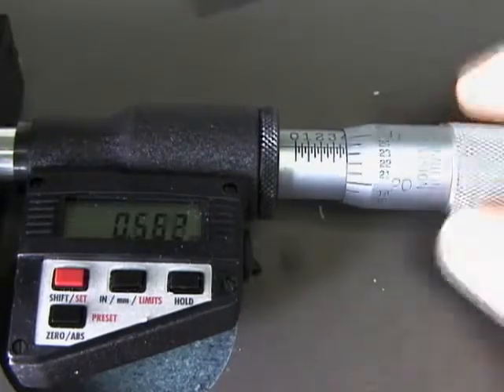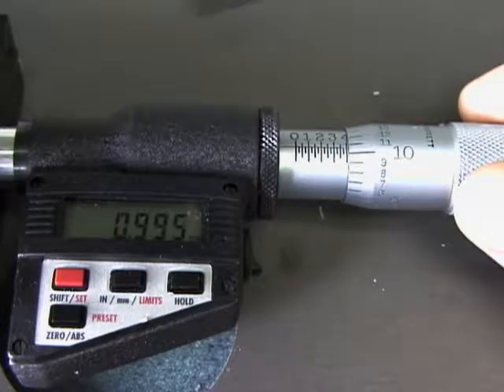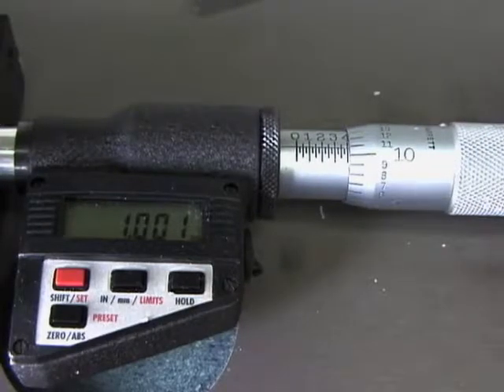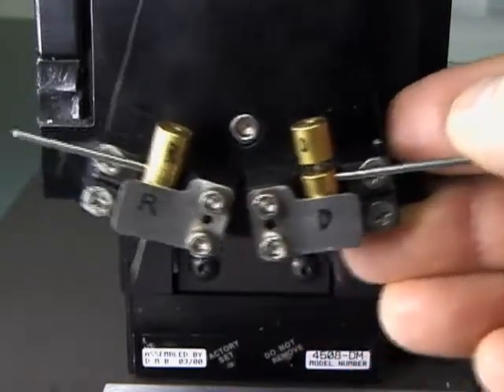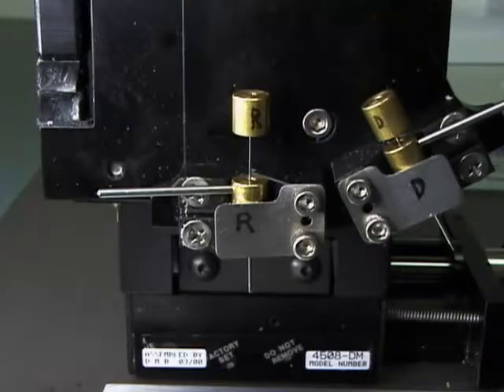To punch the next hole, move the micrometer adjustment guide 0.6 or 1 millimeter to the right. If you are off on the guide by 0.001 in either direction, it won't visually affect the array outcome. Move the turret to the recipient needle and again lift the stylet rod. Punch the hole for the first donor tissue.